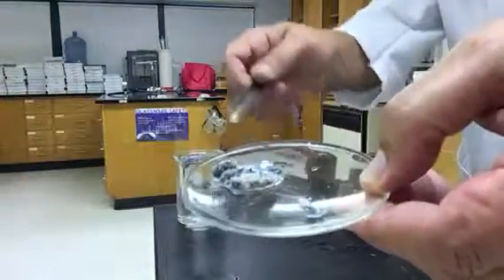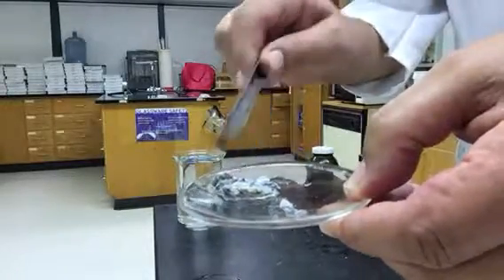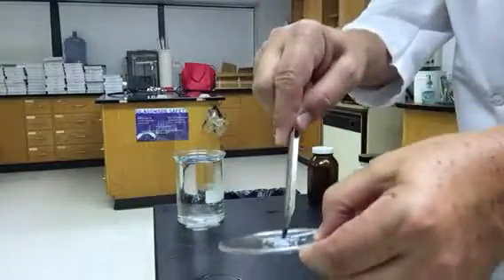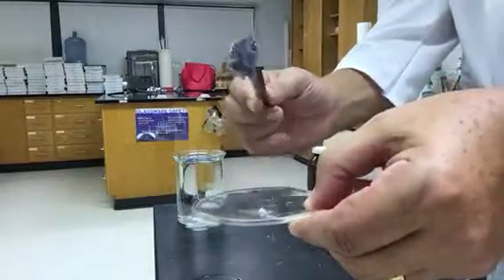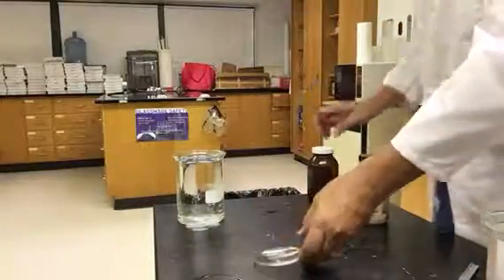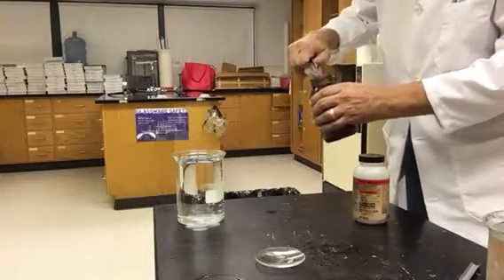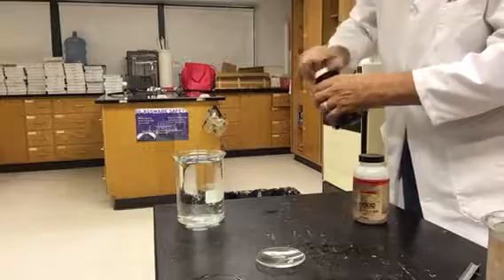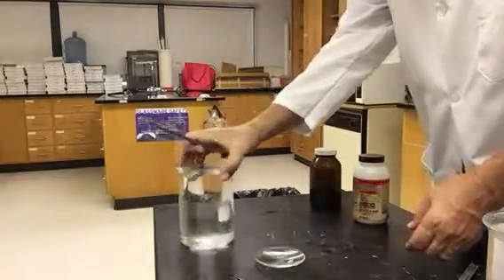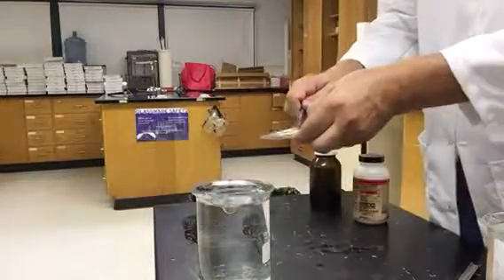Potassium is a very soft metal. It's very silver on the inside, but on the outside it has a very dark purplish grayish cast to it. Again, it's very reactive, even more reactive than sodium with most things. And so I'm going to store that in some oil, put that away. And now I'm going to put my potassium on the water. And let's see what happens.